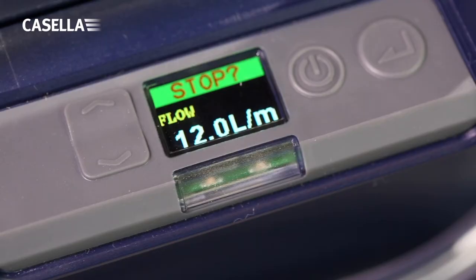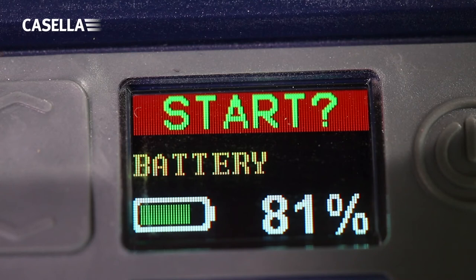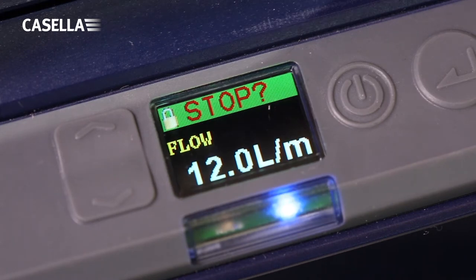Status lights indicate from a distance if the pump is running normally or if there is a fault. The battery level is also shown as either a percentage of charge when the pump is not running, or the number of hours remaining when the pump is running. The control keys can also be locked if required.